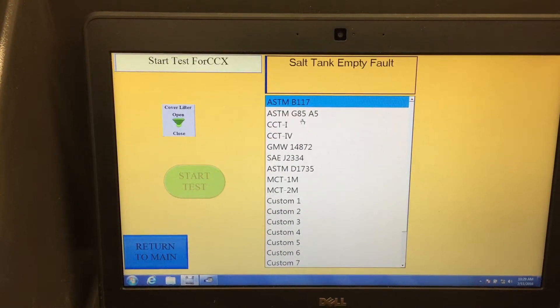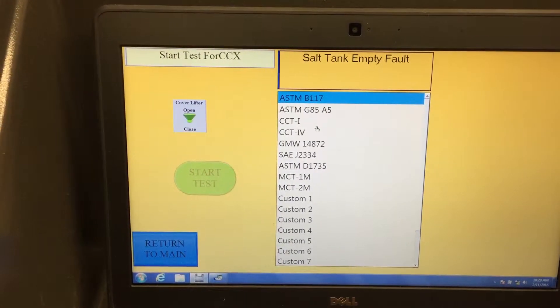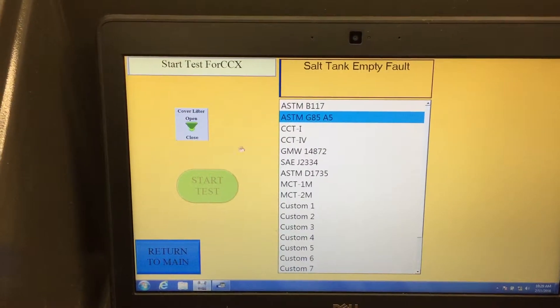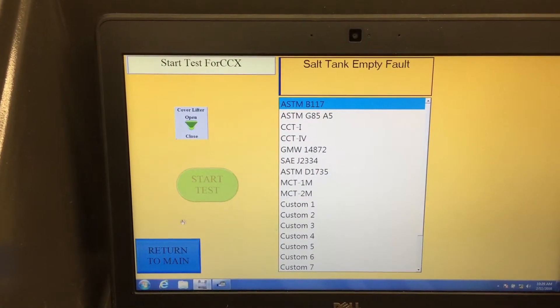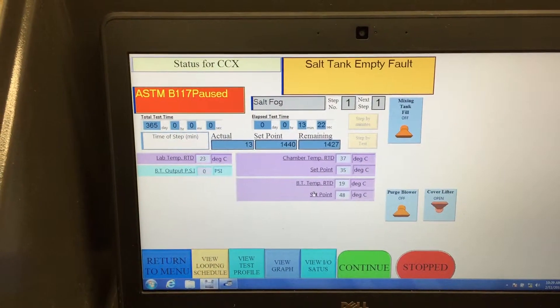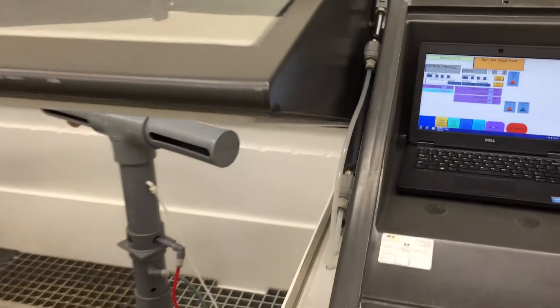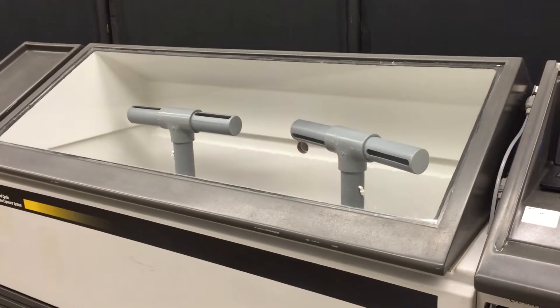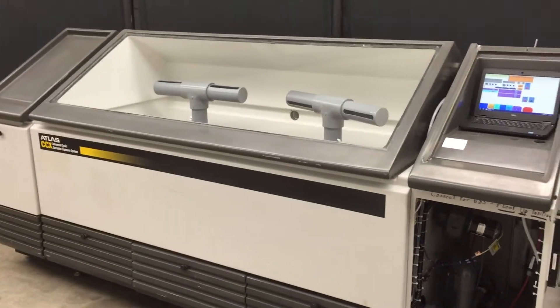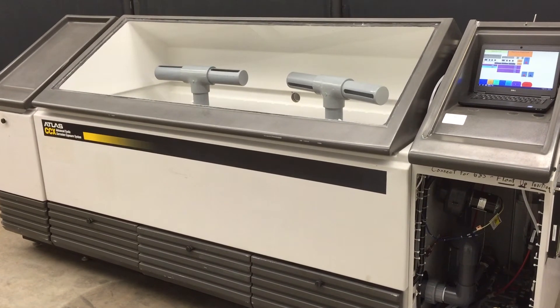Here are the other tests you can choose from. It looks like there are about eight or nine pre-programmed tests. We'll just start another one — we can't start that with the other one running. We can resume this one; it looks like there's another one available.